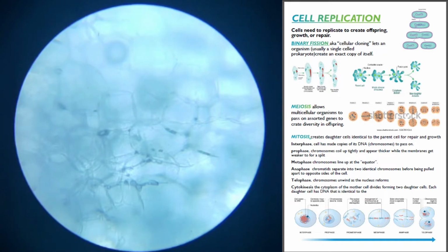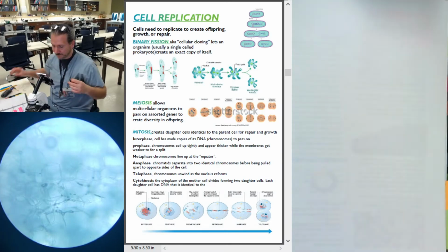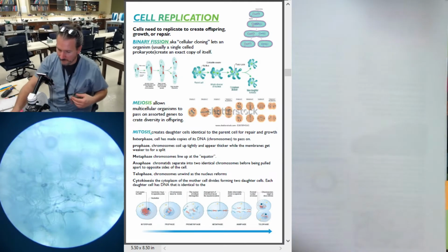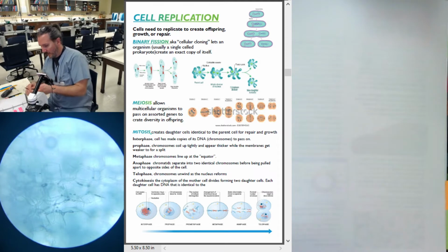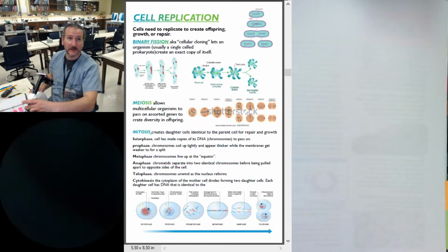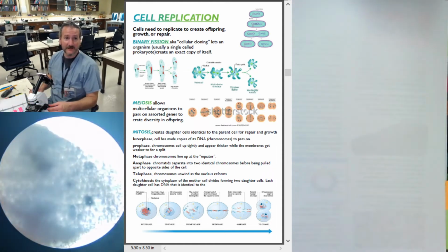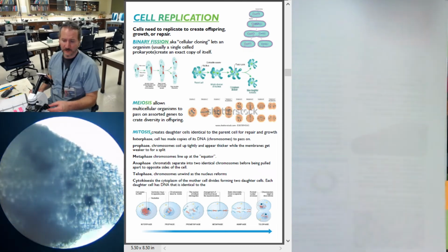You improvise. So I have my pick here. Found the pick. Methylene blue. I'm actually going to go back to my scanning for this because I really want to watch what happens. I love watching diffusion. I love it when a plan comes together. I love it when diffusion happens. There we go.